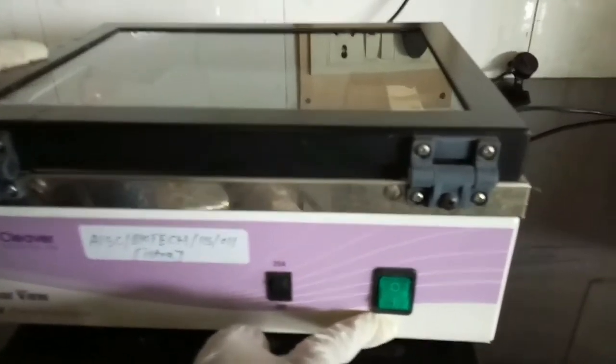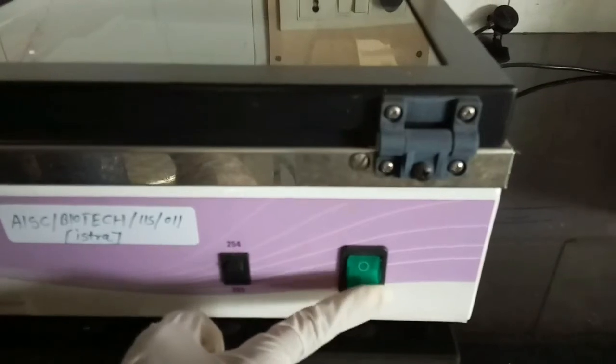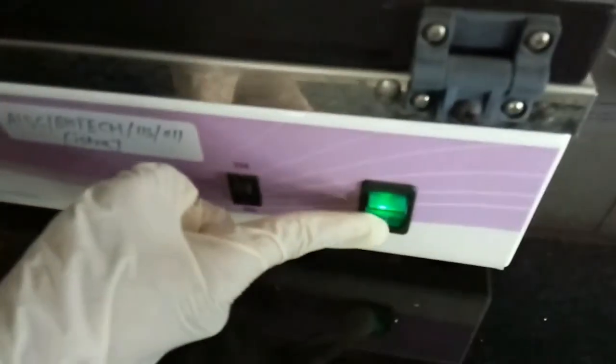With this UV button we can either switch on or off the UV light. So now I will switch on this UV button. So the bands are now seen. DNA bands are now seen under the UV transilluminator. Now we will switch off the UV light.